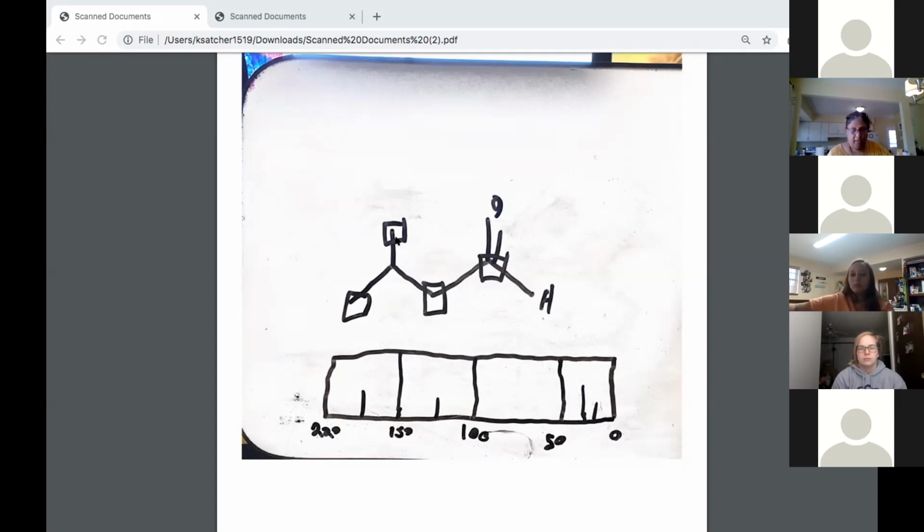If we had a better table, then we'd be able to say where the methyl carbons are, where the methine carbons are, but they did not. It's not necessary for us to go in detail at this point in time. So for those 2 methyls, you'll draw them close to each other, and for the methine, you'll draw it a little farther up. And I will ask you to label the peaks for the NMR. The methyl groups you would call carbon A and carbon B, and the methine would be carbon C, and then you'll label it accordingly with where the peaks are. After he finishes, I'll show you.